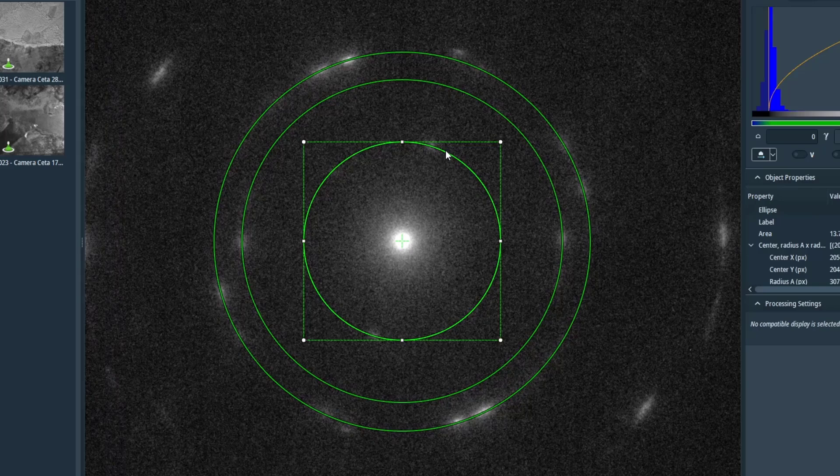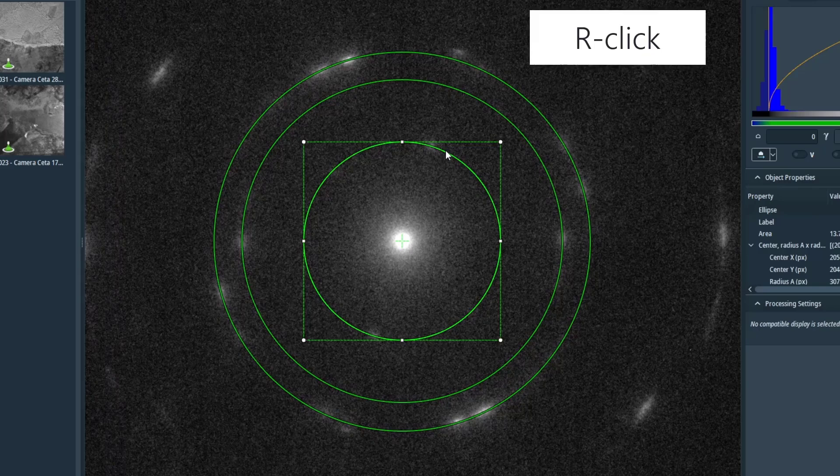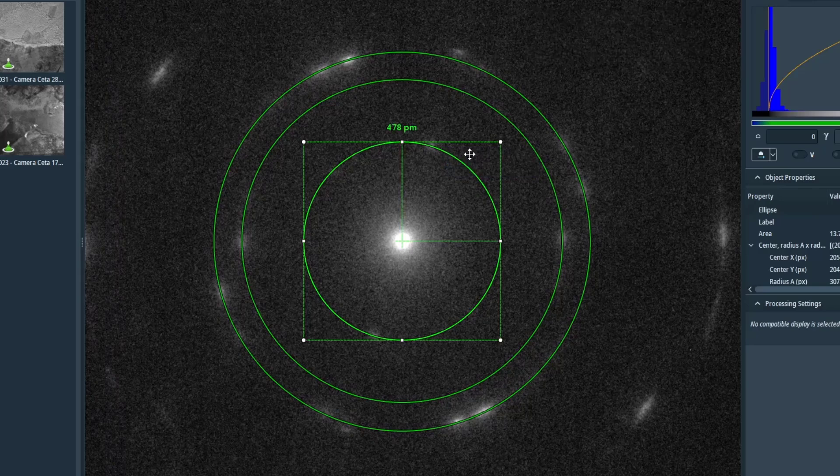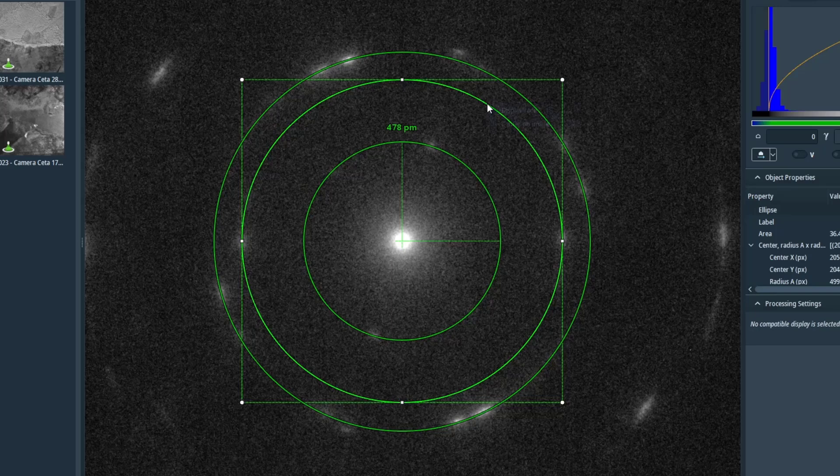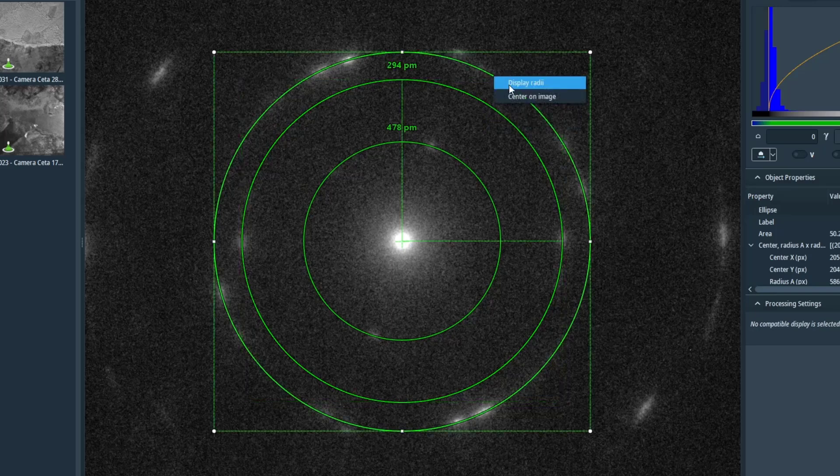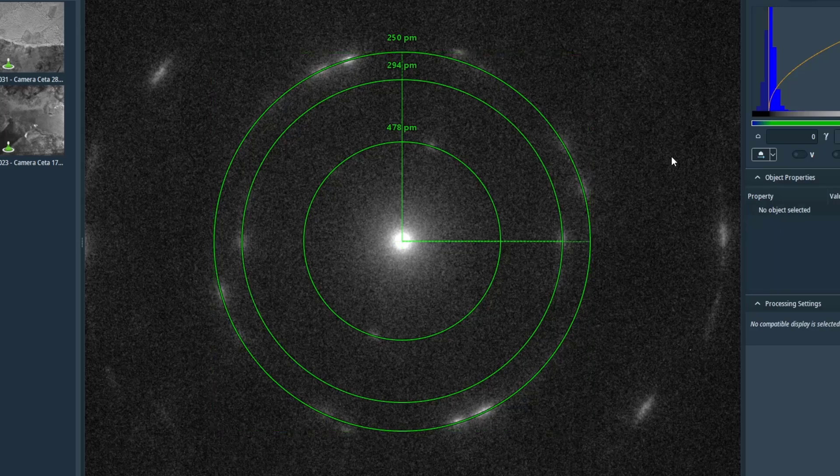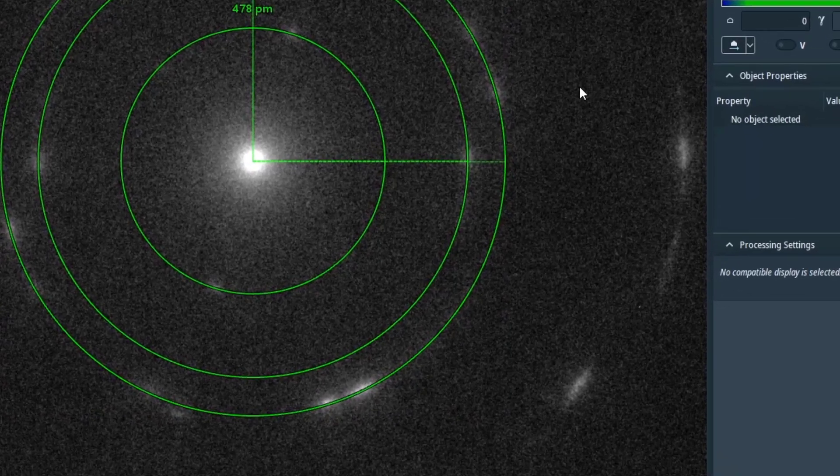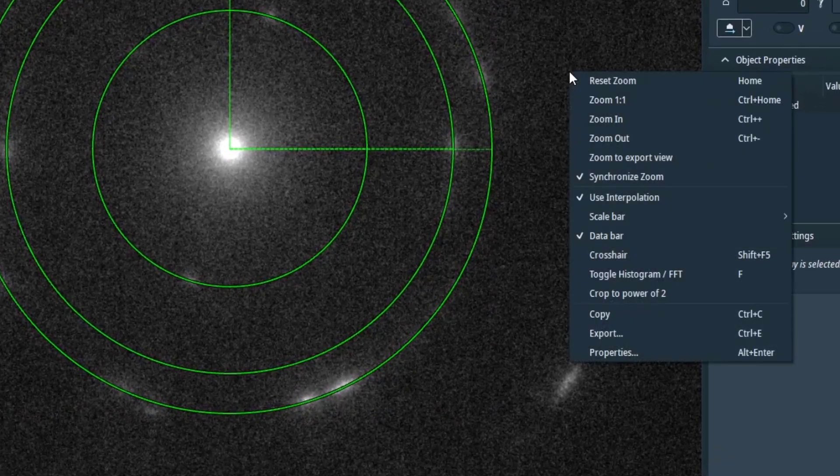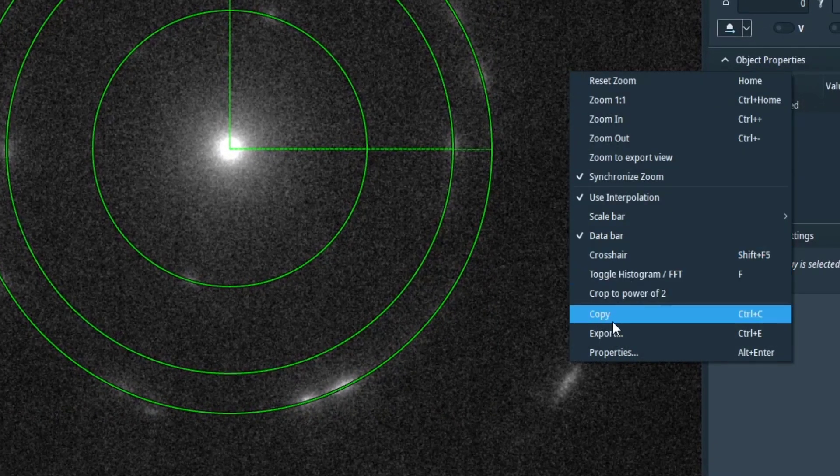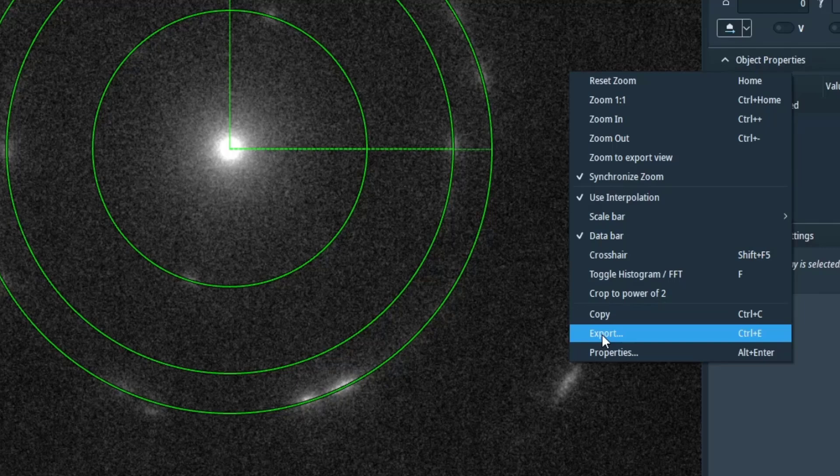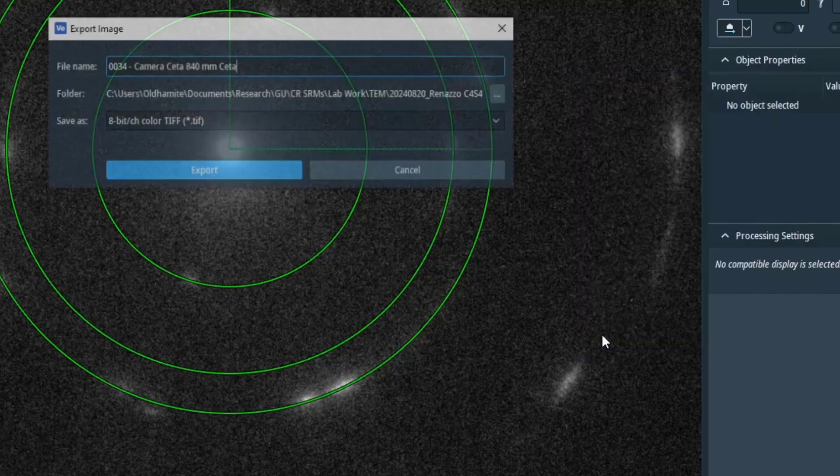Now we're going to get the D-spacings by right-clicking and say display radii, and this will give us the radii in picometers, which is a bit of a strange unit but we can work with that. You may want to save your image with the measurements as a TIFF or some other image file.